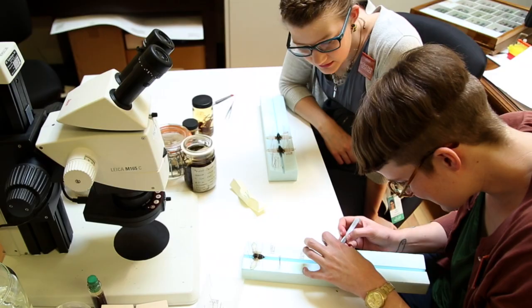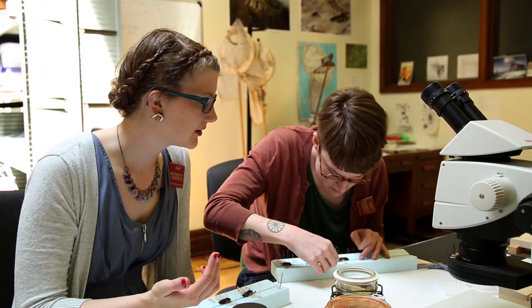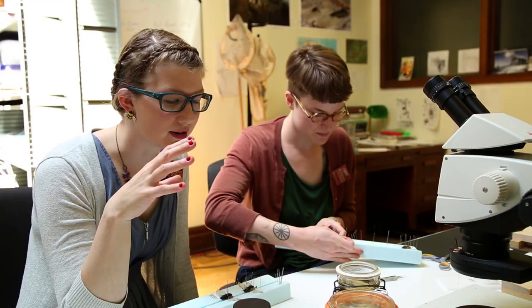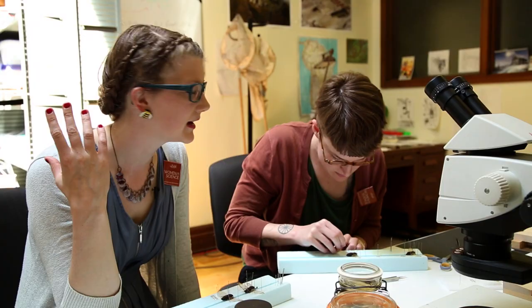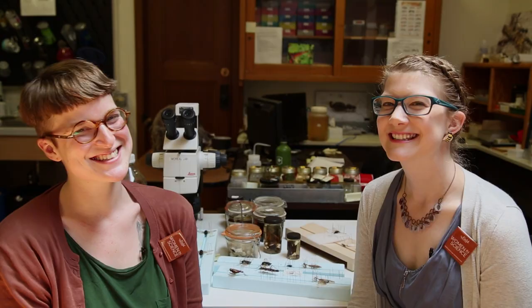We did it! I love their chubby little bodies — cicadas are super sturdy little insects. They were the first insect I ever thought about that had a lifespan longer than a few months. Certain species are on a 13 or 17-year cycle, spending the first 13 or 17 years underground living off tree roots, then they all erupt for just six to eight weeks to breed, creating this cacophonous sound. Thank you so much Grayson for showing me how to pin an insect — it was my first time and I had a good time. I feel good that I contributed to science today.